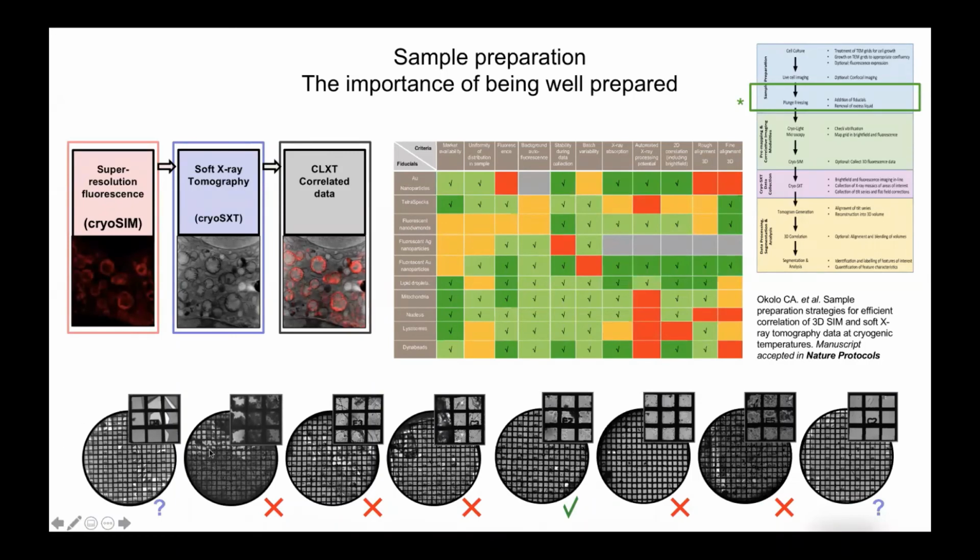Then also, if you're looking at the plunge freezing, super important. I mentioned this before, so I'm only saying it as an aside, that there are many ways to prepare a grid, and God knows we've seen them all, only a few that are absolutely spot on. So we are here to provide protocols, advice, and expertise. I hope people will take advantage of that as much as possible. Provided this has been taken into account when you start with the sample, it's likely that the process will give you results very easily and efficiently.